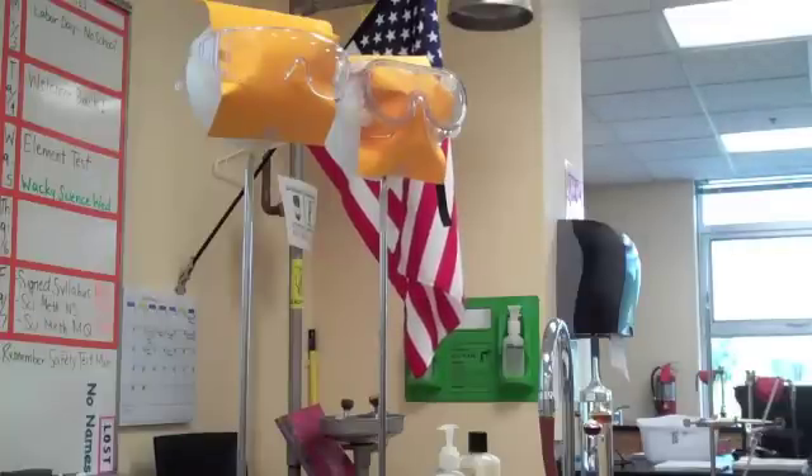I don't know if there's any in Clorox or not — that's a good question. It's going to be dangerous to breathe; it hurts really bad when you put it on. It's very stinky. That's why we've got both fume hoods on today.